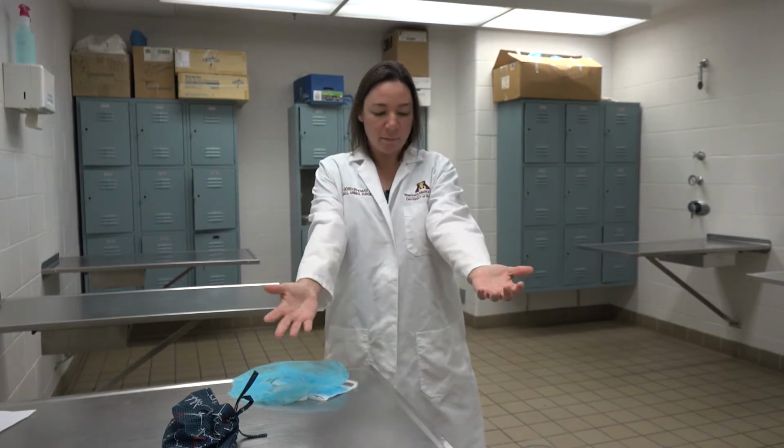Out here in the induction area, it's fine. You don't need a cap, you don't need a mask. You should have your lab coat on. Your lab coat is protecting your scrubs. I can get my lab coat all dirty. You could probably see the hair all over it. That's fine. When we enter the surgery suite, lab coat comes off, so our nice clean scrubs are underneath.